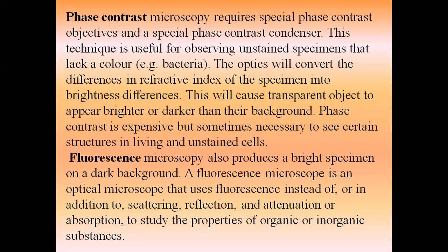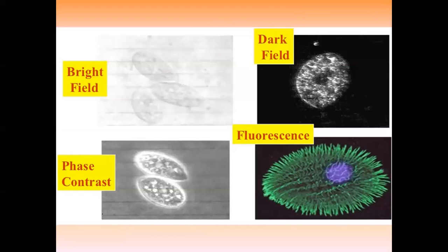How does any sample fluoresce? When you subject light on it, it will absorb the light and after some time it is going to release the same amount of light.